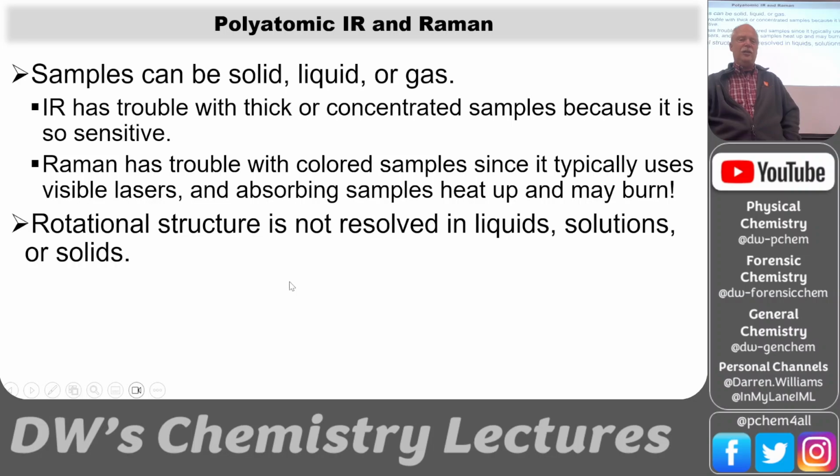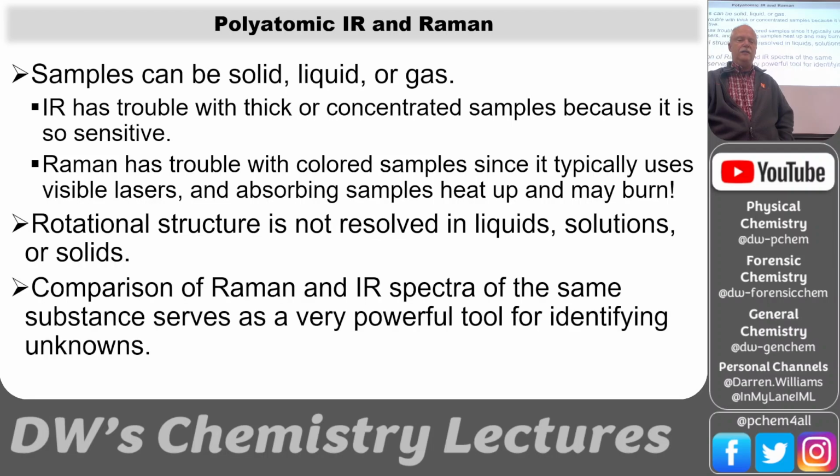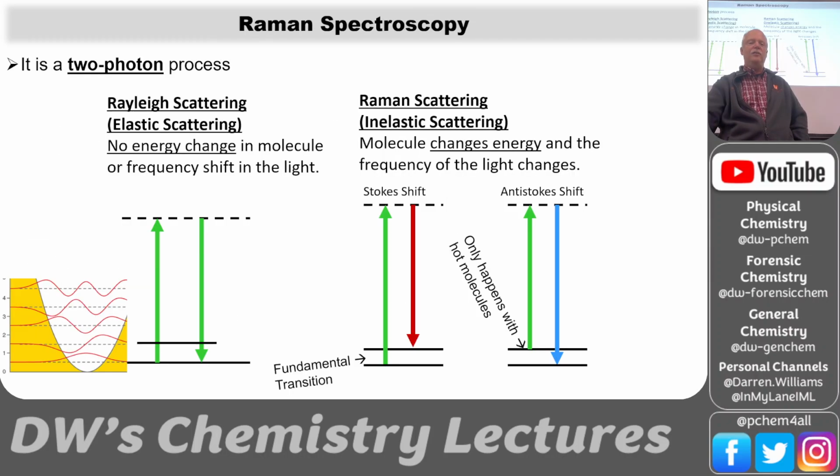And then rotational structure, you can see in the gas phase, but you can't see it in the liquid phase because the molecules can't freely rotate, and certainly not in the solids. Okay, but it's really good to compare IR and Raman spectroscopy because both of them give vibrational information. So here's now the infrared absorption and Rayleigh scattering and Raman scattering, and here's from the first slide, the vibrational spacing. And so this little spacing down here is really close together, and that's the vibrational spacing.